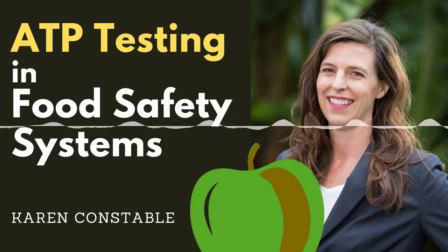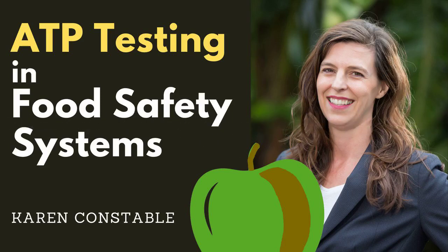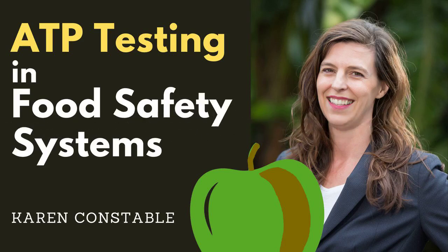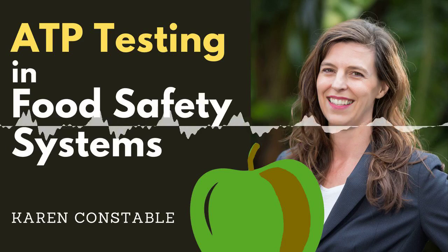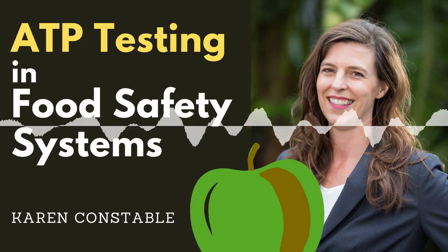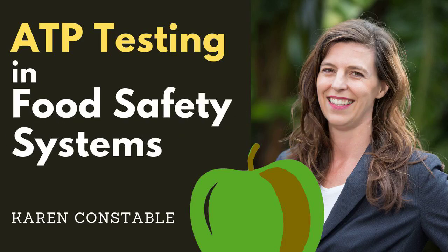Some of the luminometers include software that will link to your computer so you can keep electronic records. 5 facts you might not know about ATP tests. At least 1,000 bacterial cells, so that's 10 to the 3, must be present in a sample for there to be enough ATP to be detected by commercial ATP testing systems.